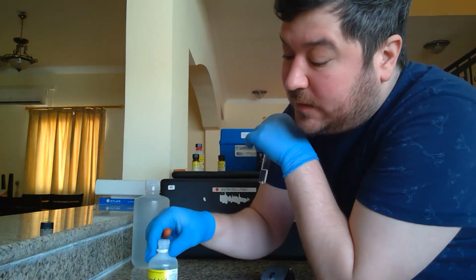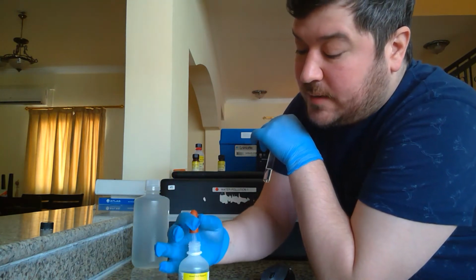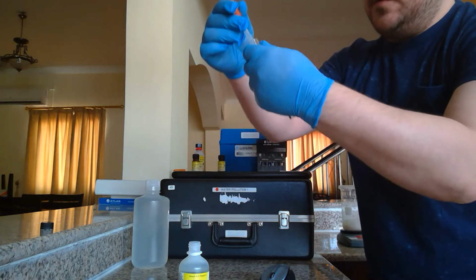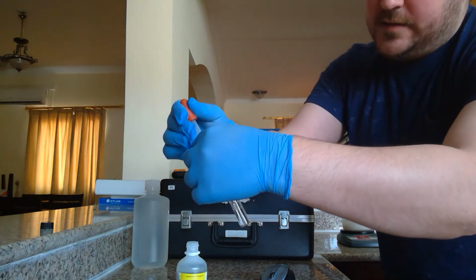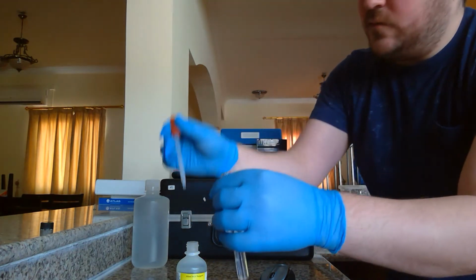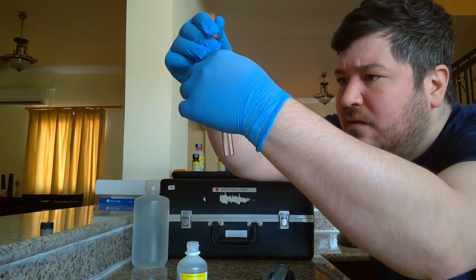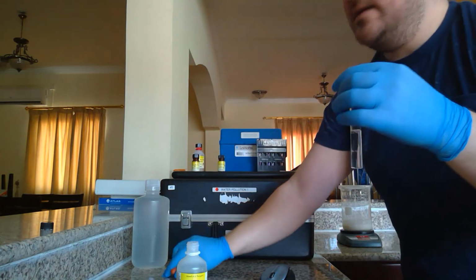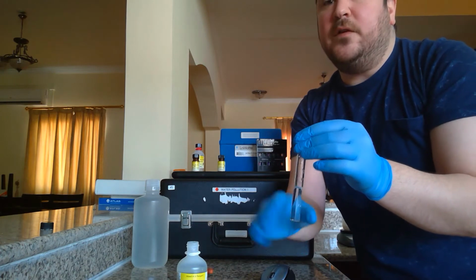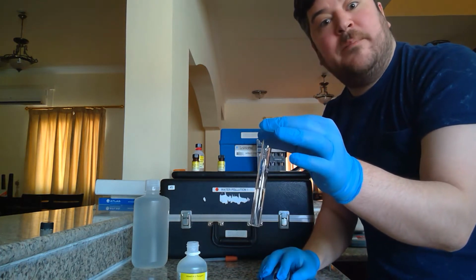Fill it to the 5 milliliter line with the mixed acid reagent. So I'm just going to fill this up to the 5 milliliter line. The test kit comes with this pipette as well, so it comes with everything you need. Okay, and it says wait 2 minutes. There is also a cap that I'm going to put on this while I wait, so I'll be right back.